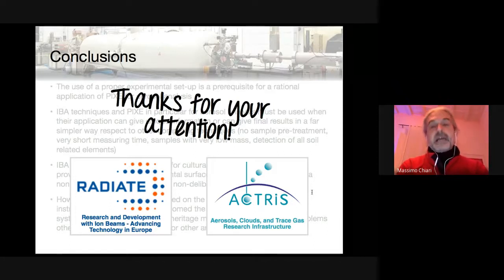So also for climate, where most of the people working there are not nuclear physicists, where nuclear physics is just a minor actor, but our laboratory is a European reference laboratory for elemental mass determination in aerosol samples. So we are making like a calibration center for this kind of analysis by other European partners.